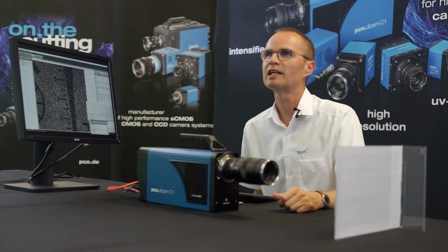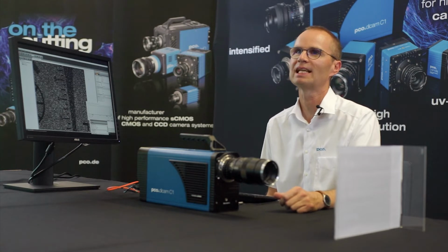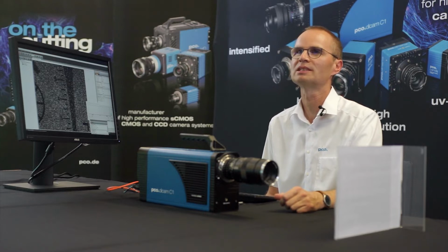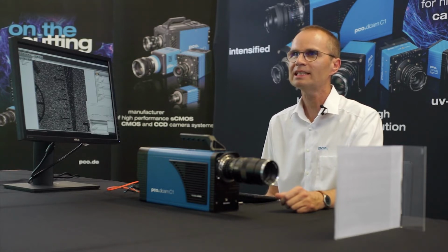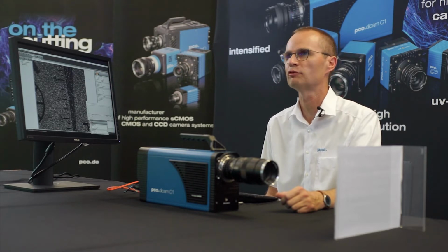The image intensifier shows us effects of quantum statistics we are not used to seeing in everyday life. The light emission of almost every light source follows a so-called Poisson distribution, which means that even an absolutely stable light source does not constantly emit the same number of photons at any time. Take a hypothetical light source which emits 10 photons per second on average. One second, it's 9 photons. The next second, it could be 12.